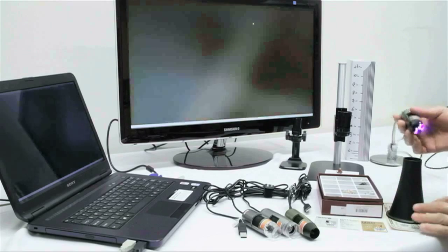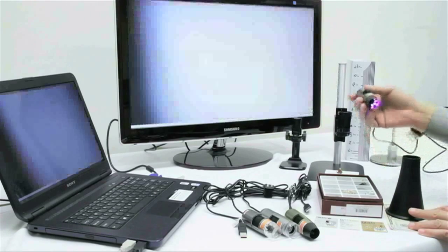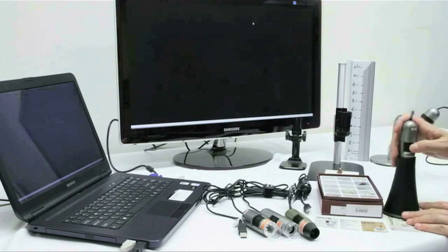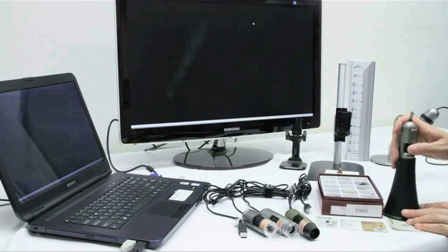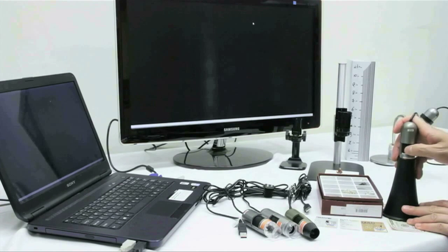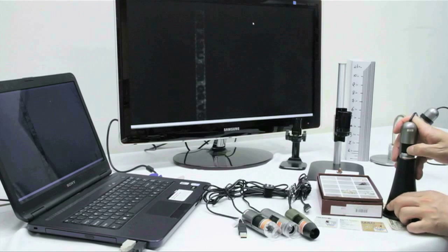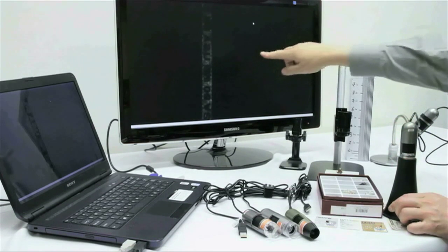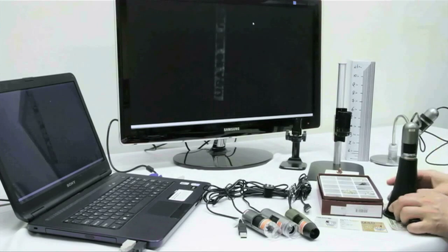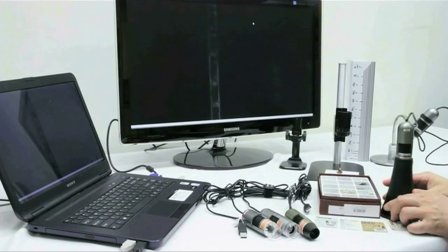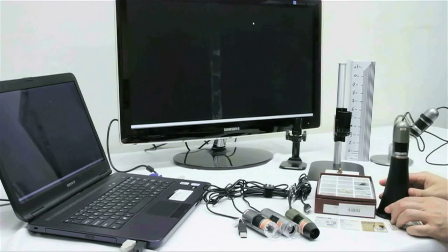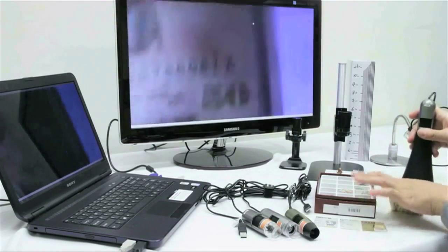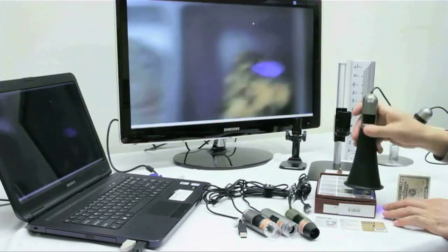So now we will incorporate the 502 stand, and that will give us a little bit more of a working distance, and it will filter out all of the other ambient light that is affecting our image. Now in this video, it may be a little bit harder to see, but you can very well see the fluorescent strip that they do have within the bill. It does pop out at you when you are using this combination.